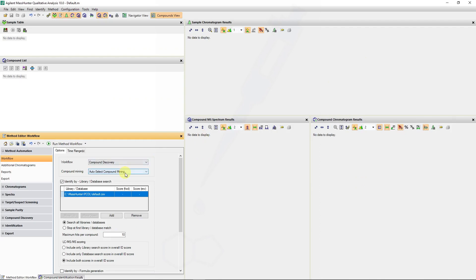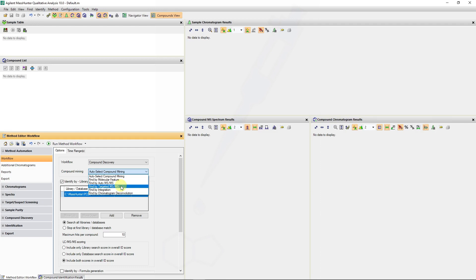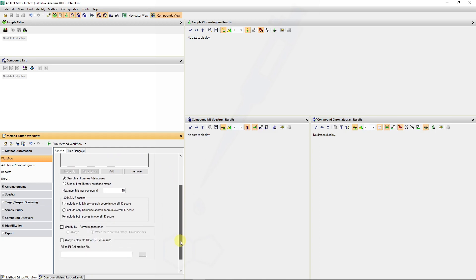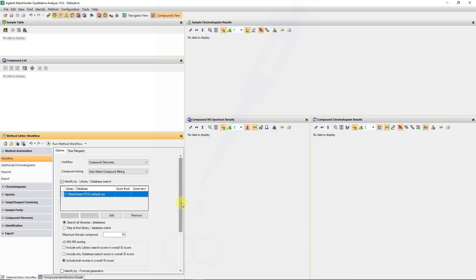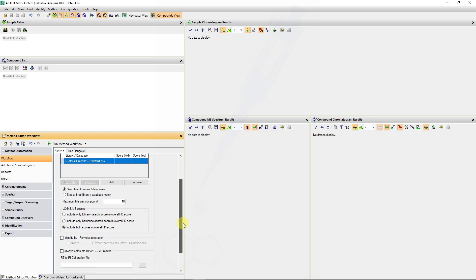The next workflow I want to discuss is compound discovery, where we've got different mining algorithms that enable us to detect molecular features or find features out of the data files. This is useful for database searching or for formula generation — a truly untargeted approach compared to the target suspect screening approaches we've seen previously.